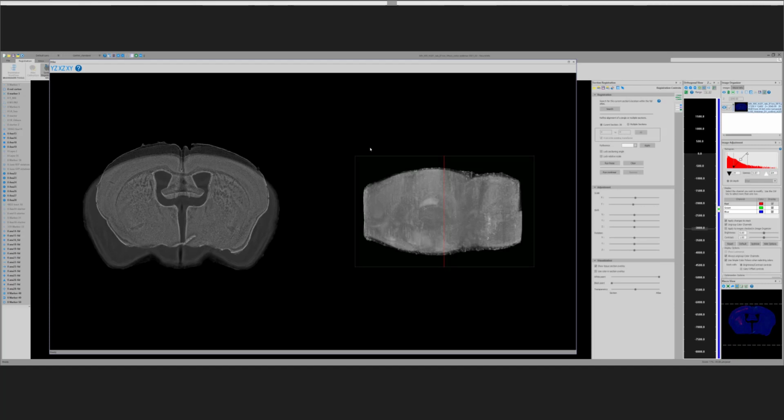What we found is when we do the registration, almost all of our brains are Nissl stained. And so the images are different than the 2 photon images. So we generated an average Nissl brain that was then very precisely registered to the Allen space. So the coordinates in our average Nissl brain, which was generated from 70 to 80 original brains, that's what we use to register. The program does enable using different starting atlases for registration. The one we're using now is an average Nissl.